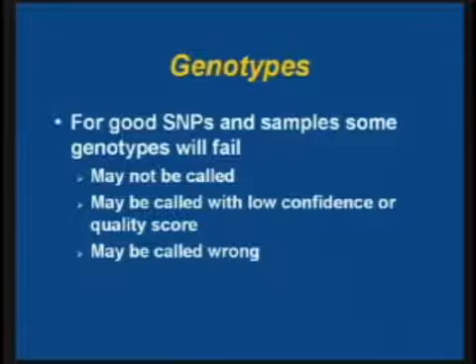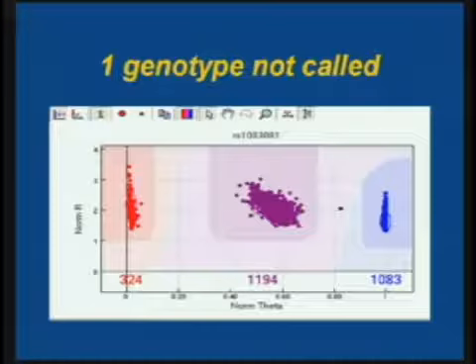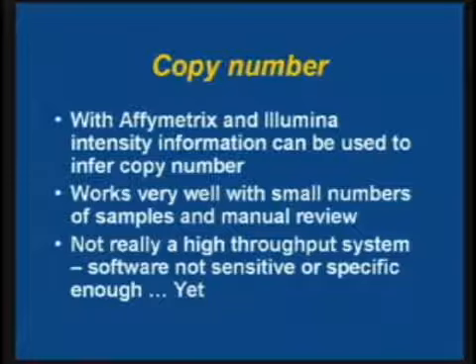Even for great SNPs and great samples, some individual genotypes will fail. They may not be called, might be called with low confidence or low quality scores, or they may be called wrong. There's one isolated genotype that didn't get called for an otherwise great SNP. Here's one for Affymetrix where one just got called wrong — clusters weren't quite in the right place. There's going to be a little bit of bad data, but hopefully it's small enough that it doesn't affect the results.